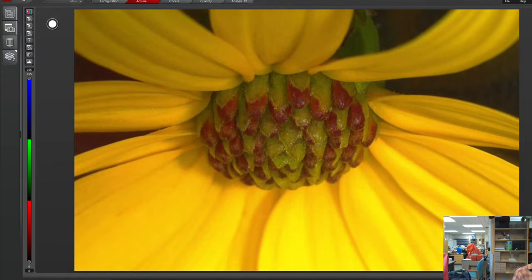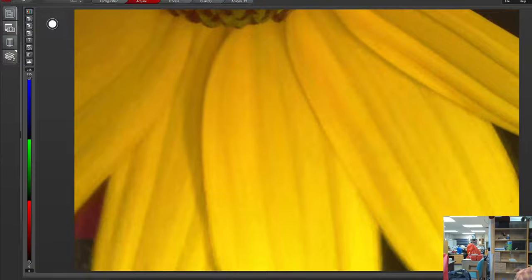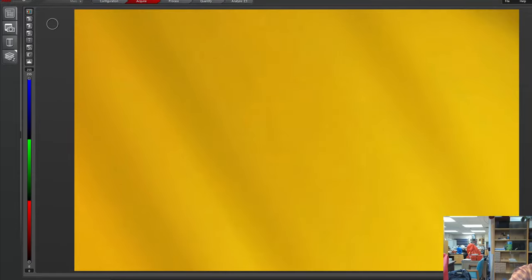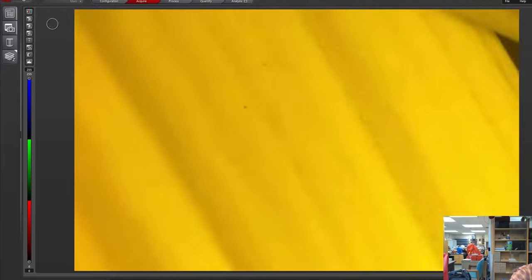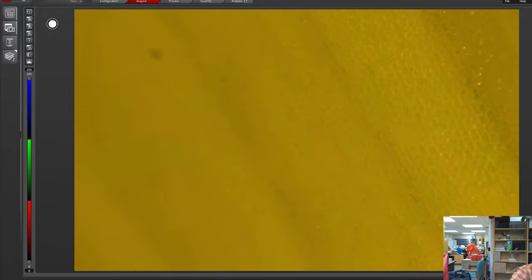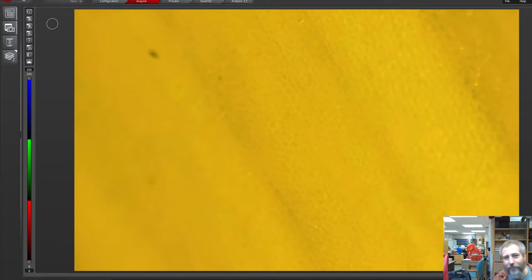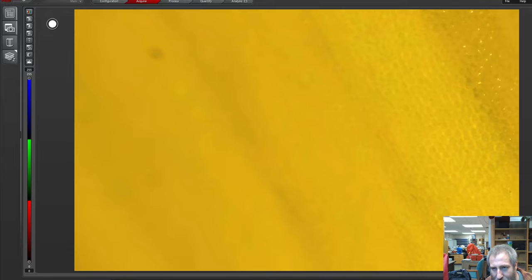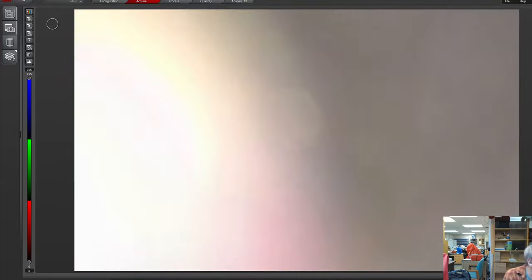We've looked at some of the petals before very closely in the scanning electron microscope. We got down to the cellular level and we're looking at individual cells. I don't think we can get quite that close on this thing. Well, I guess we can kind of see them. Hang on. Just barely see the cells. Which we could see pretty clearly in the SEM, but they were also a little shriveled. So there's the petals. Just making a pile of stuff that we've gone through. There we go.